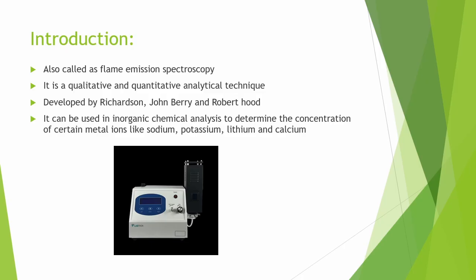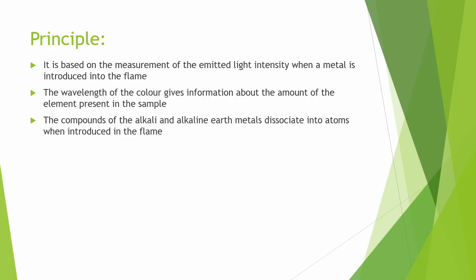The main use of this flame emission spectroscopy is that it can be used in inorganic chemical analysis to determine the concentration of certain metal ions like sodium, potassium, lithium, and calcium. So here is a pictorial representation of the flame photometry.